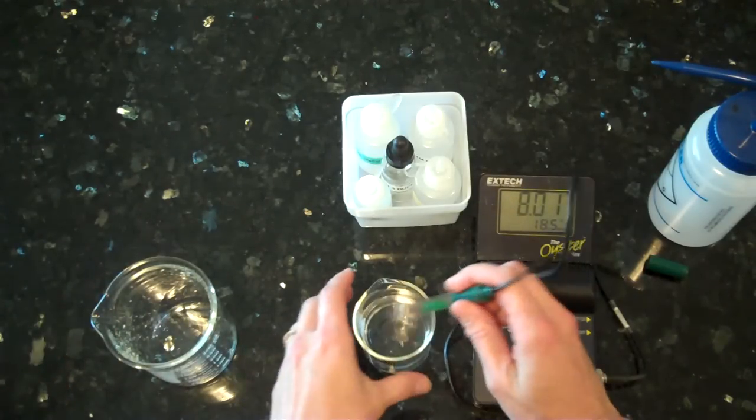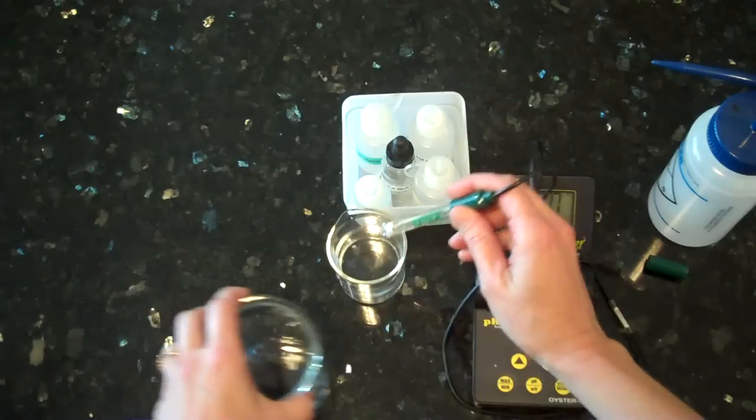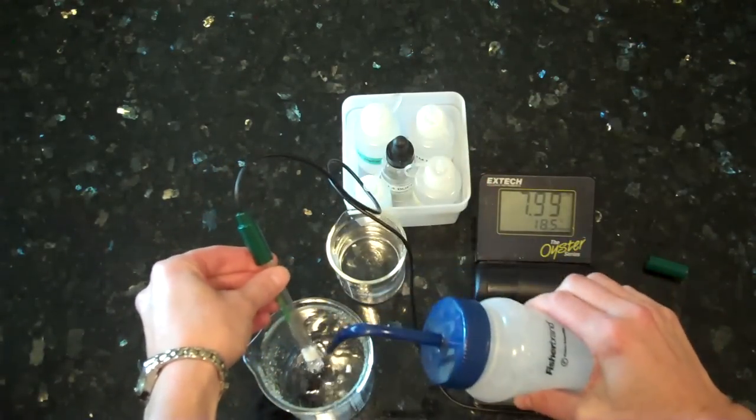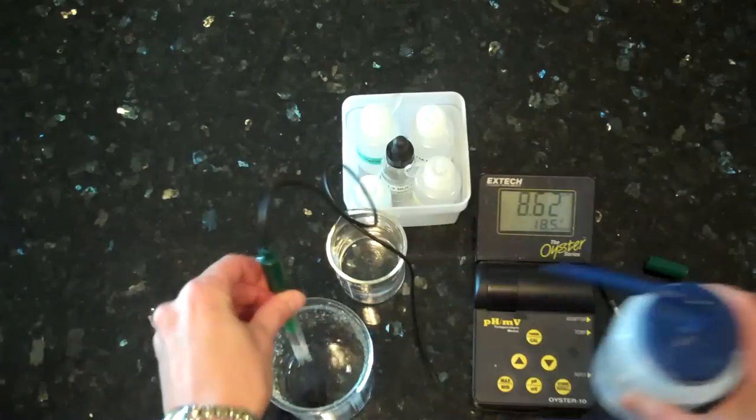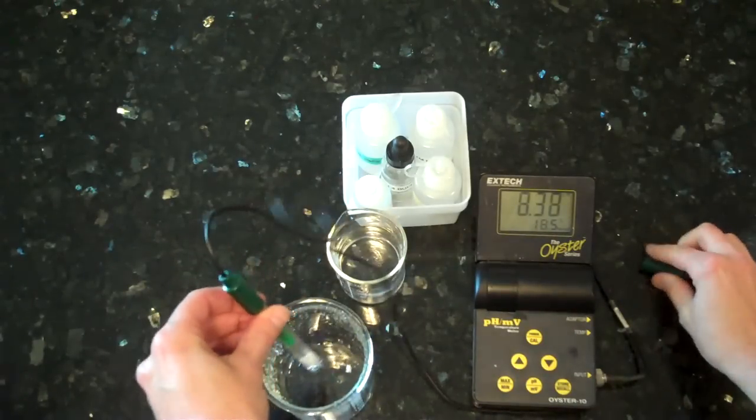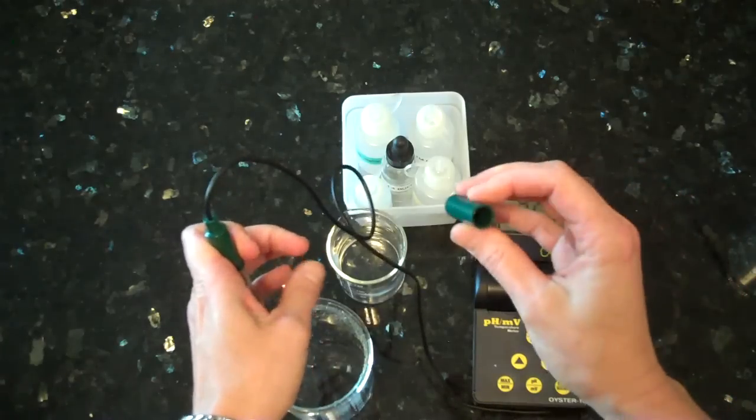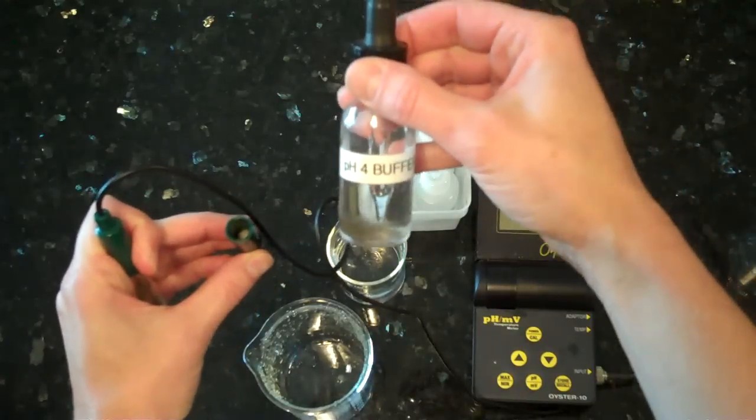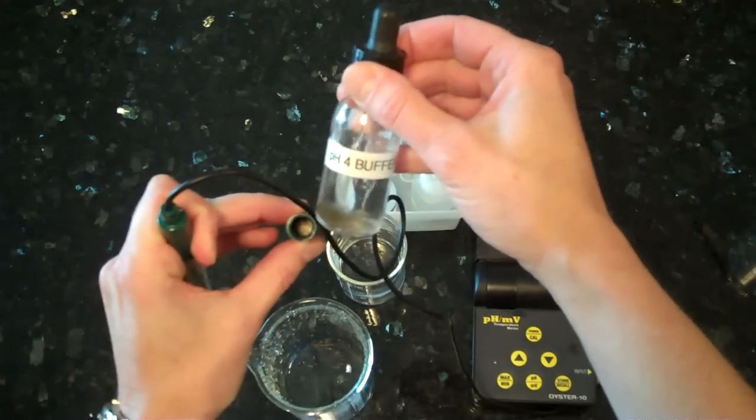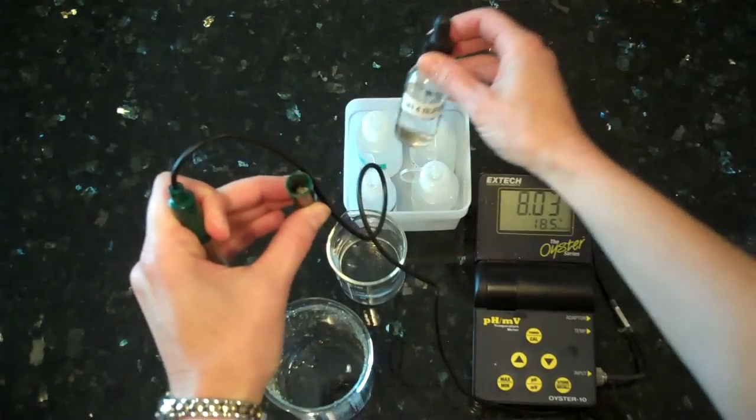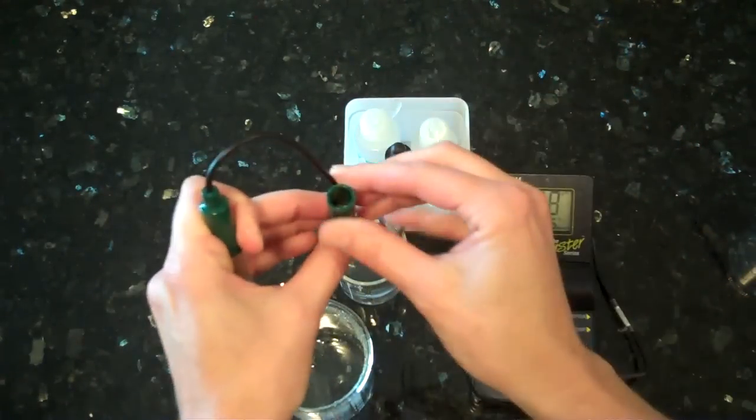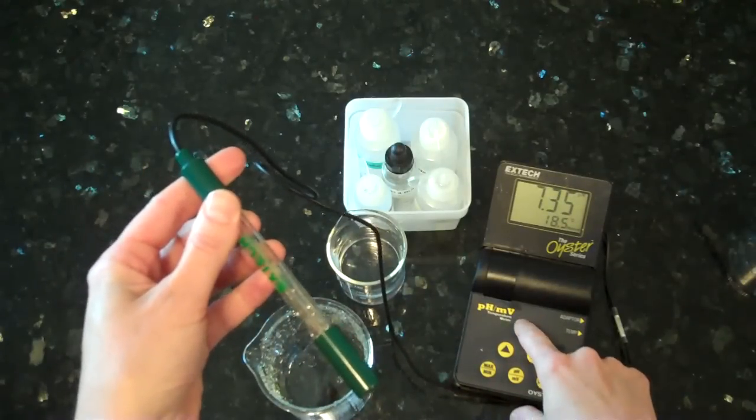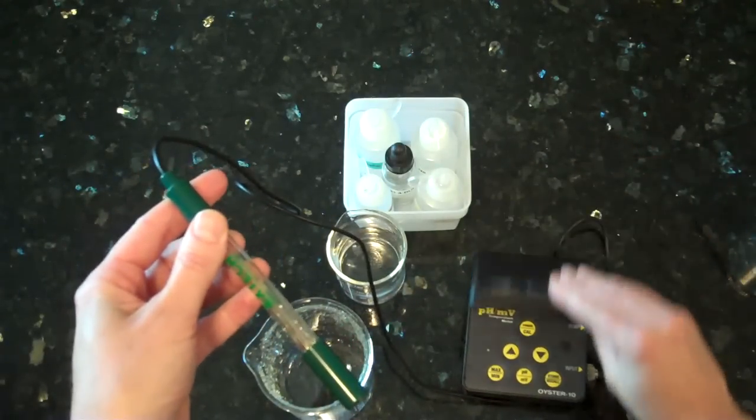the pH meter, you simply take out the probe. You need to rinse it off. I am doing all the rinsing into a waste beaker. You would then take the cap and add a drop or two of pH 4 buffer right into the cap and let it soak into that sponge. You would close the cap, turn off the pH meter, and close it.